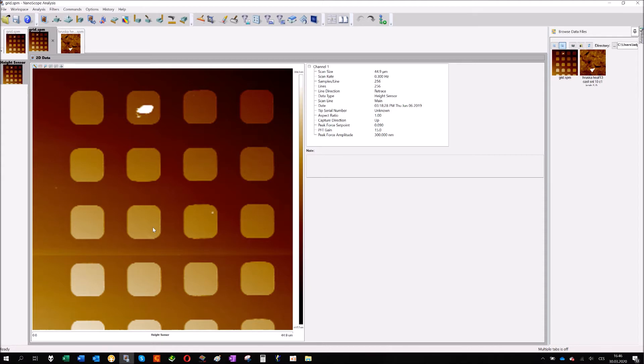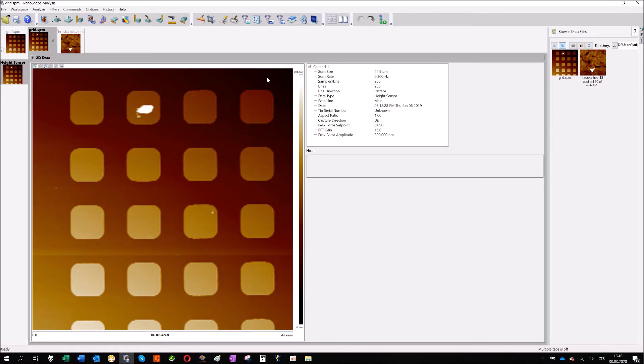Before any further analysis you need to compensate for it. You need to remove the tilt from the measurement. Bruker has a special tool, it's common for AFM image analysis. It's called flatten.